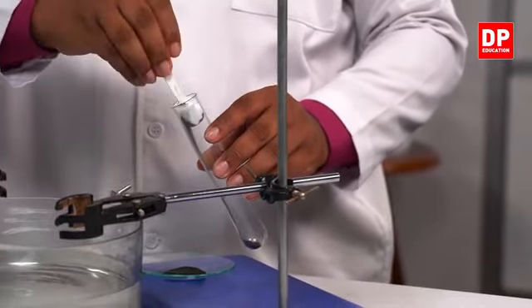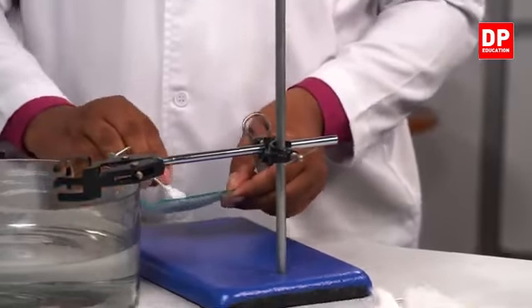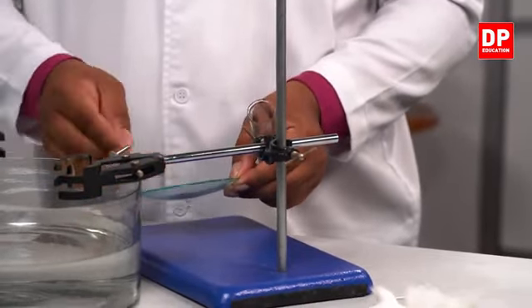Right, we'll add some more iron powder into the system. Right, that's enough. So I have inserted some amount of iron powder into the first boiling tube.